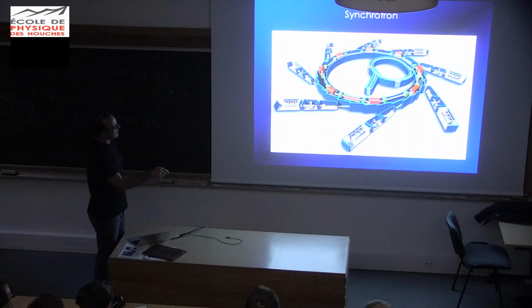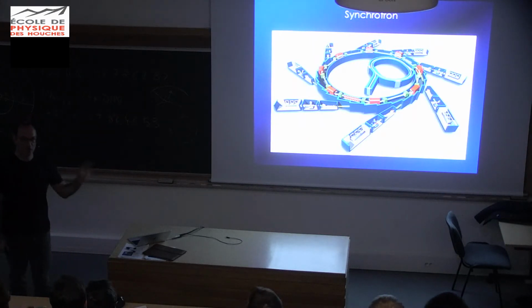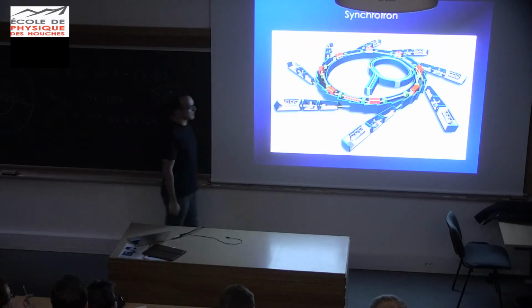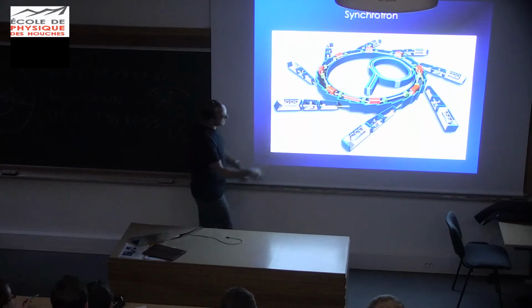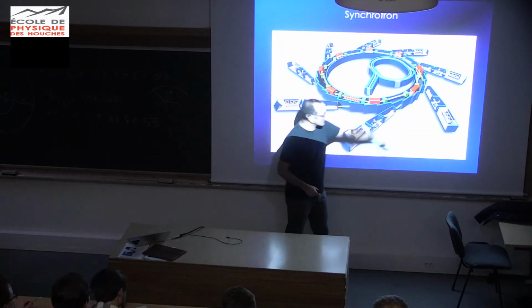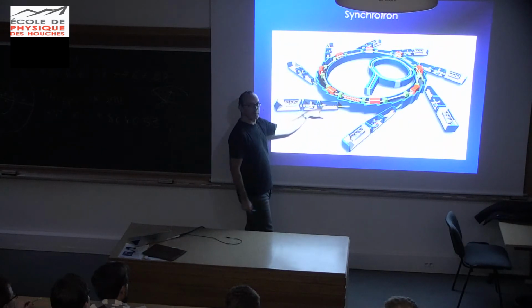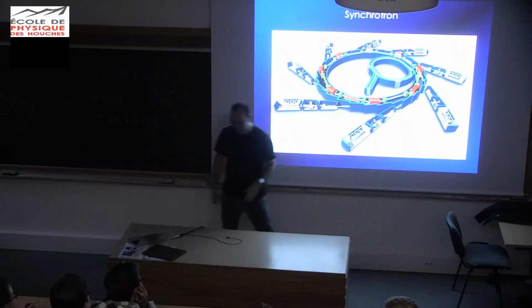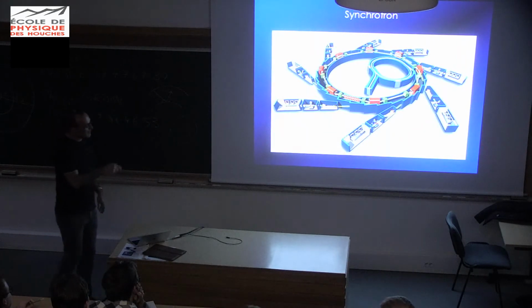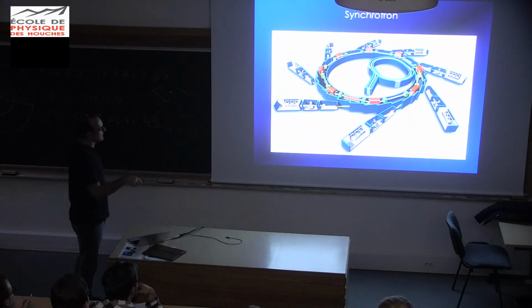It's basically a huge ring with electrons going around very fast, at the speed of light. And everything that goes around is always being accelerated, right? And as you know from electrodynamics, a charged particle that's accelerated emits radiation. And with the acceleration that they have, they are emitting in the X-ray part of the electromagnetic spectrum. So basically, at each one of these, what they call insertion devices, it shoots out not electrons but X-rays, basically like a laser that comes through these little beam lines where you put your samples, your detectors, computers, people. Okay, so you got these electrons running around at the speed of light, emitting X-rays, and people are sitting here day in, day out, and measuring stuff.